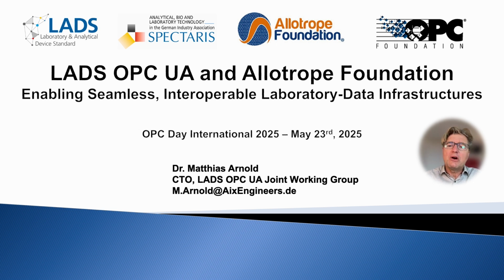Many of you know OPC UA from industrial automation, but today we'll shift focus to the laboratory and analytical domain. Unlike industrial automation, the outcome of laboratory and analytical processes isn't typically a physical product, it's data. That's why seamless integration between data generation, documentation, and processing is so essential.